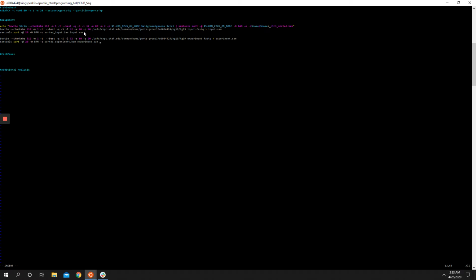Then we would have had our experiment aligned and our input aligned.